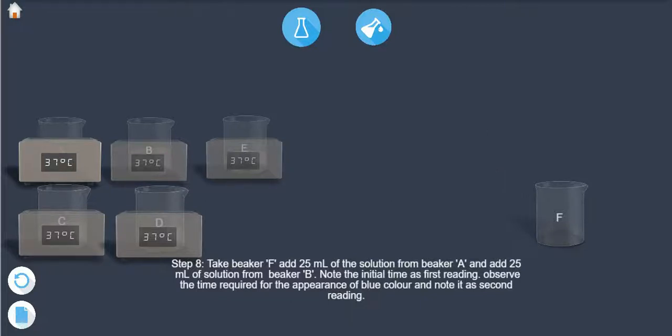Step 9: Note the initial time as the first reading. Observe the time required for the appearance of blue color and note it as the second reading.